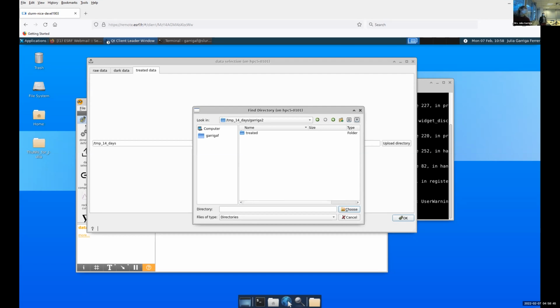I heard a voice for a second there, but then. Yeah, sorry. I don't have the treated data tab in my version. Well, now that's worrisome. Okay. Yeah, that might be problematic.